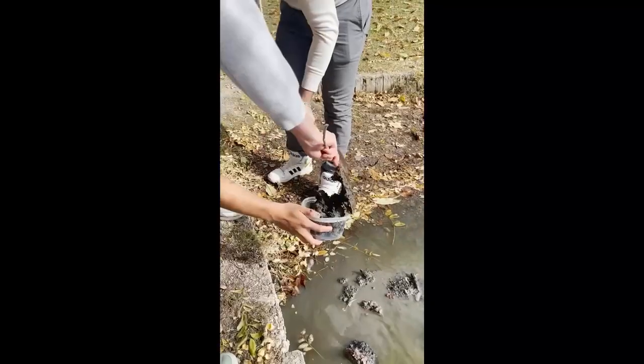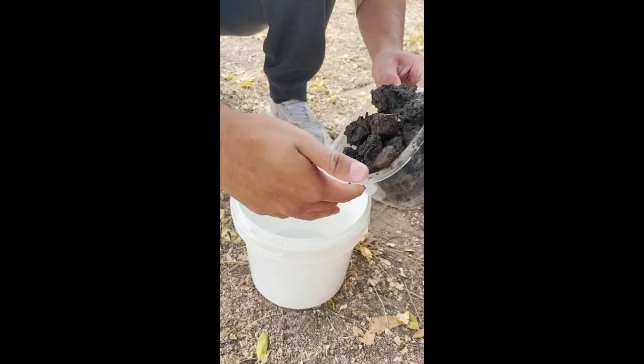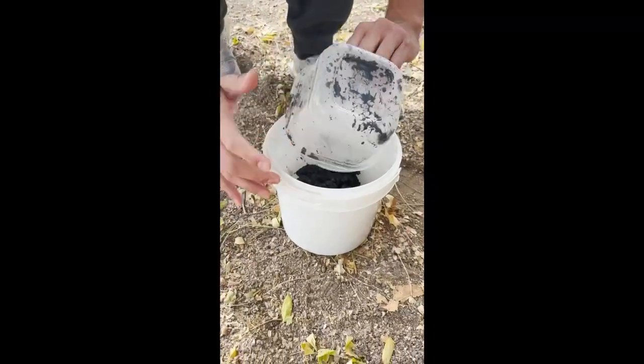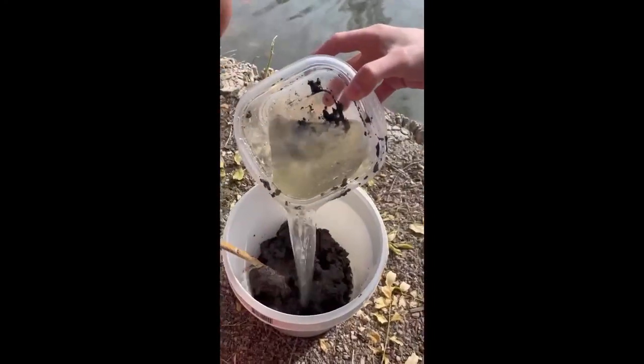In a small bucket, you're going to add 5 cups of mud, removing any sticks, leaves, or rocks. Next, you want to add the mud into a bigger bucket. Stirring the mud with the stick, slowly add water until the mixture is a thick cream. Be careful not to add too much water.